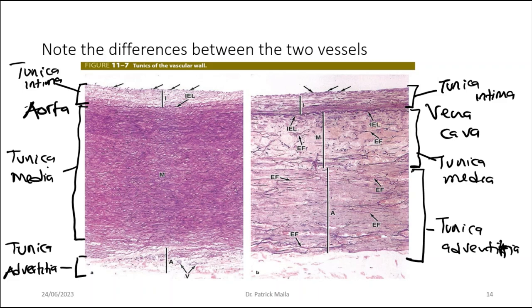These arrows here are simply pointing at the endothelium. The endothelium, we've already established, is made up of simple squamous epithelium. So draw this and label these. What they've labeled here are just venules, and this one here is an arteriole. So draw this histological slide and label it.